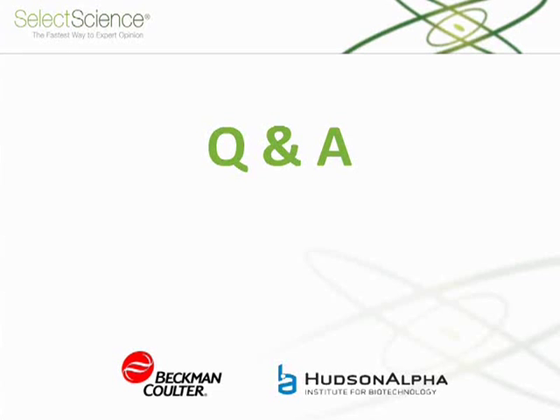Yeah, I think I touched on this before, so I won't spend too much time on it. At this point, it's really an opportunity to save on three things. One is it saves some time where you're not changing tips when appropriate. Secondly, it gives you an ability to reuse the same tips to save on plastics consumables. And when I say reuse, I mean reuse within the same method. We actually don't retain tips between methods.